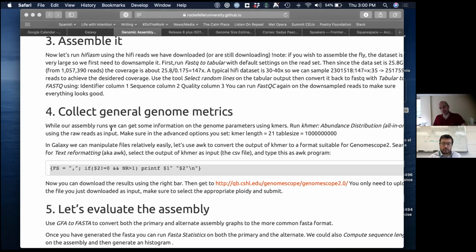And then of course we're also skipping the very first row because it's the header. You can then use AWK with printf, which, if you're familiar a bit with the command line, is a popular way of printing output.